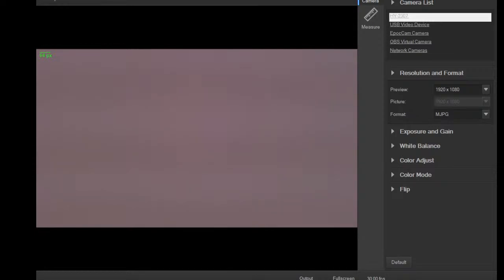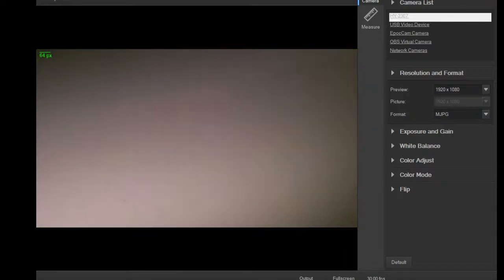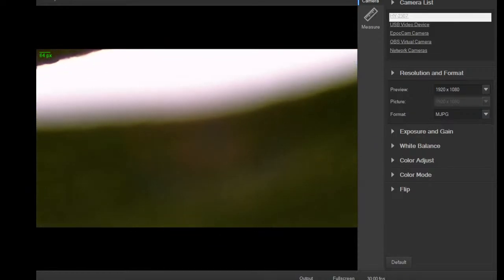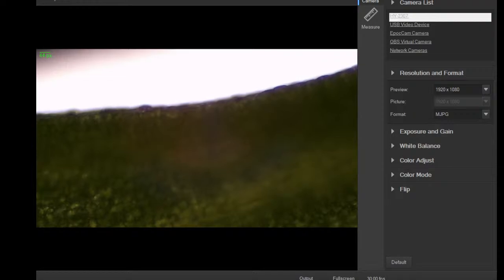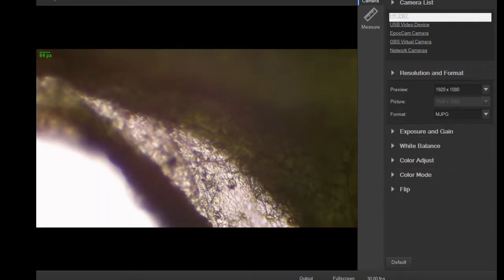In thicker stuff, you can use a process called a microtome. You can actually build your own microtome. There's some guys that make some cool videos on that on YouTube, for microsectioning thick things like a carrot, and you can make these really nice thin sections. Let's see if this does a little bit better job. And it's flatter. There you go. It's the thin part of the tip there.